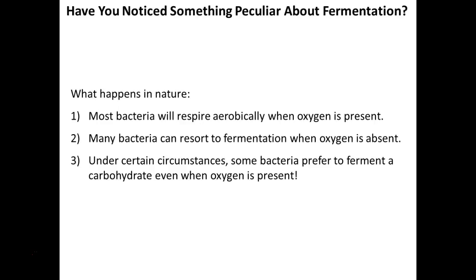That's perplexing, is it not? Why on earth would you do that? You have oxygen. Why aren't you aerobic and respirating? Why are you fermenting, right? Look at your tubes. There's oxygen in here, but that's fermentation, is it not? We've got acid, we've got gas.